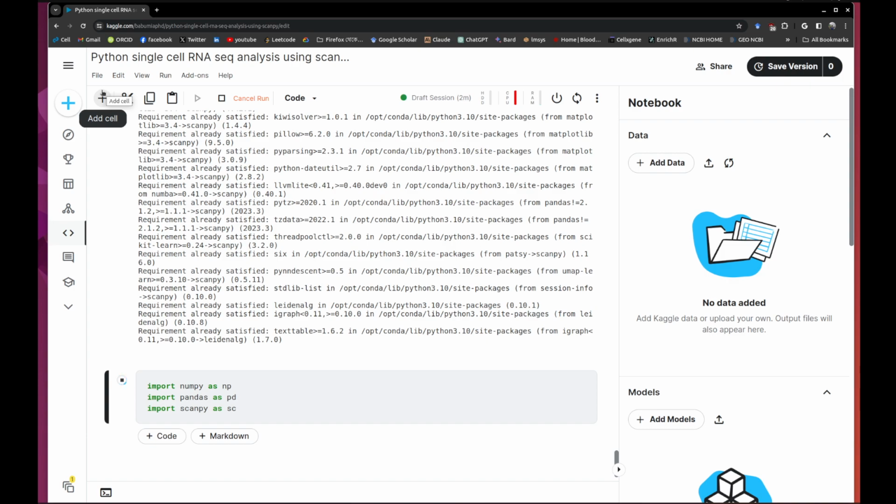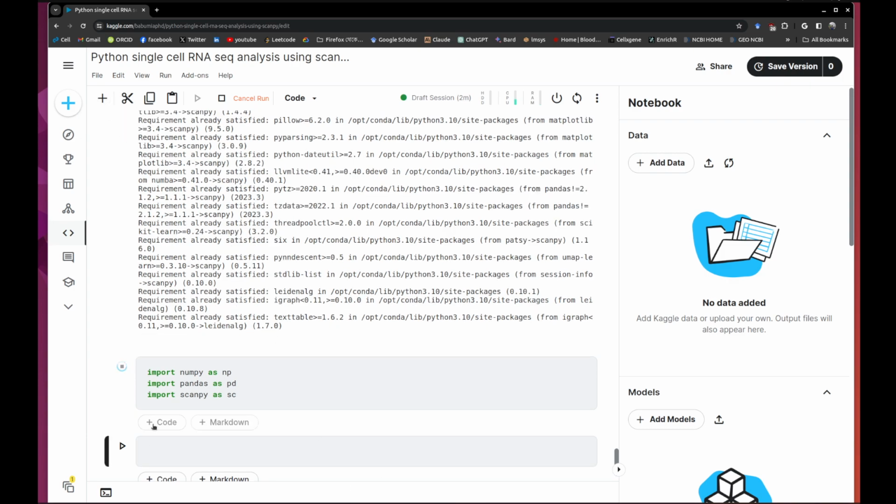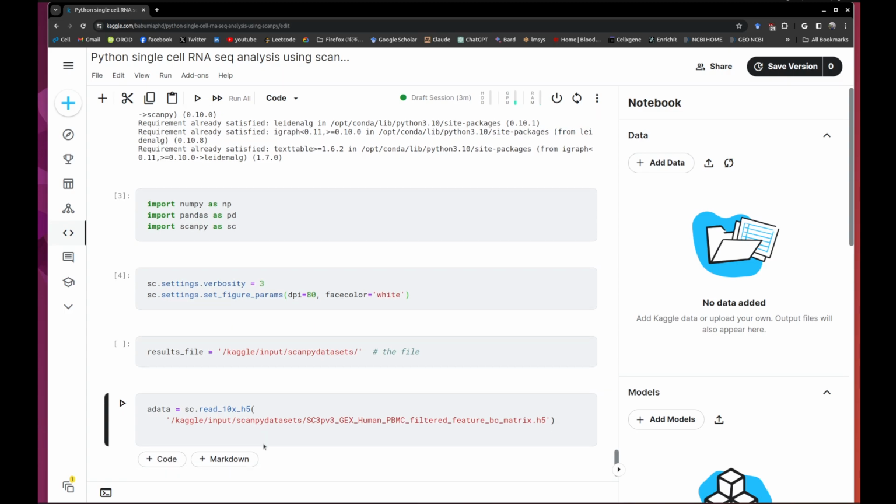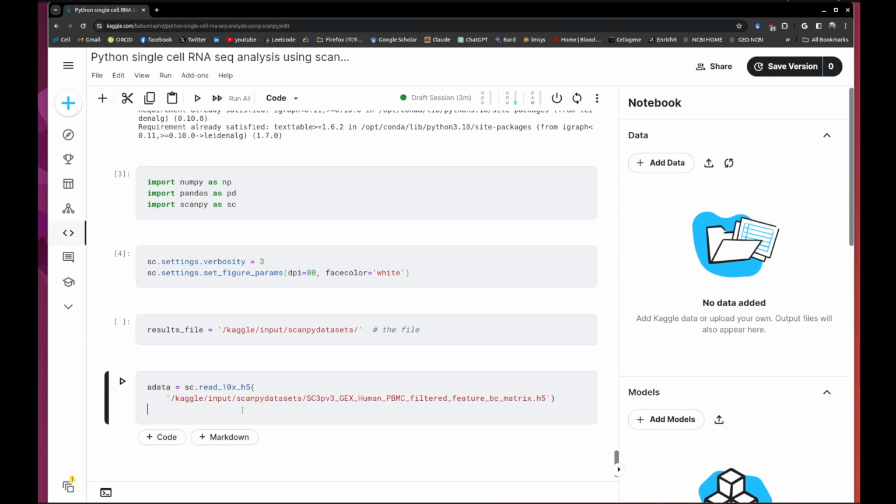The next part is, after that installment, we'll be setting this up. Now we need to set up, okay, we want to load the results in here, the file. And a very important thing in there is loading. If you see another video we have on how to load the data in Scanpy, you can get it in there. Here is where, if you add the data, you have a link where you have got it. So this is kind of adding those data in here.